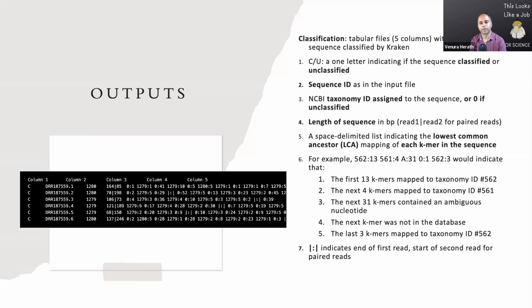Okay, so for the NCBI taxonomic ID, you can simply search the taxonomic ID inside the NCBI taxonomy database. Then it will direct you to the relevant species. Let's say if you type 561 and search, you will find the corresponding organism.